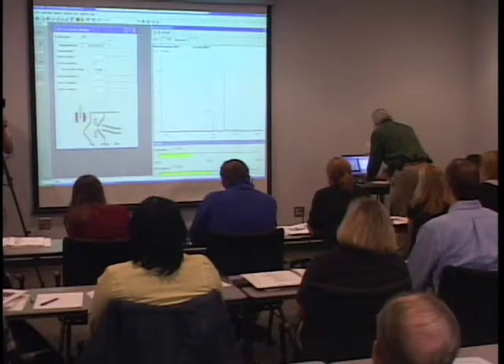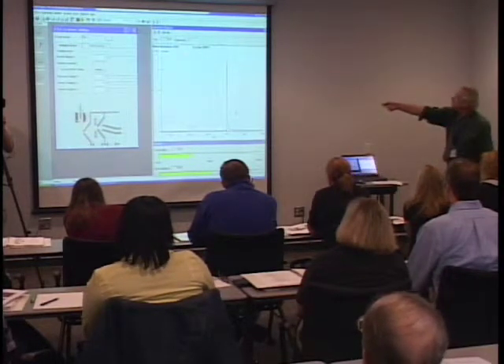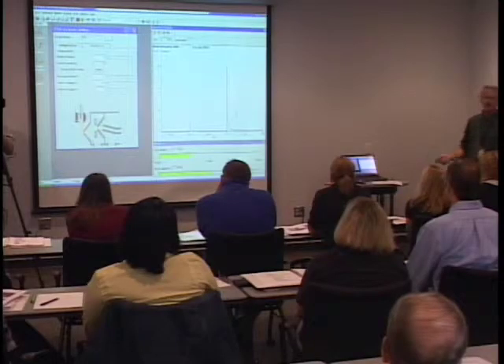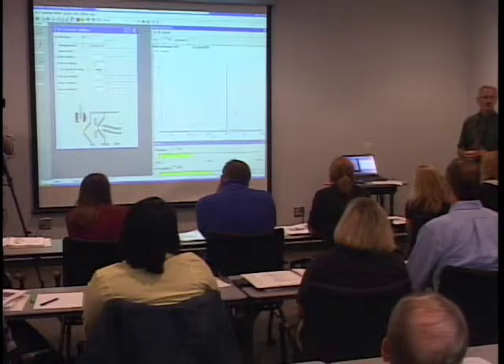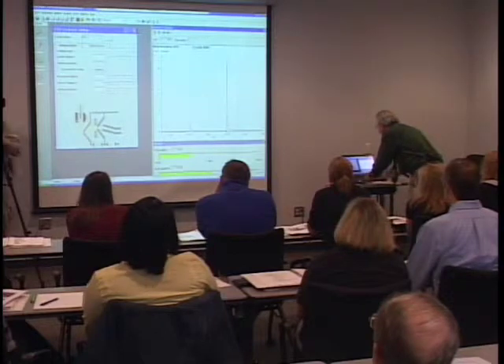You want to see what the peak shapes actually look like. These are low masses — the resolving power is less at low mass on a time-of-flight. It says the resolution is only about 1700, but that's okay for mass 18. At mass 600 it's going to be about 6000. That works out in our favor because at low mass we don't need as much resolution. There is some junk in the background, some tailing, and the peak has a shape to it. Let's set this back to a normal value and look at a larger mass.